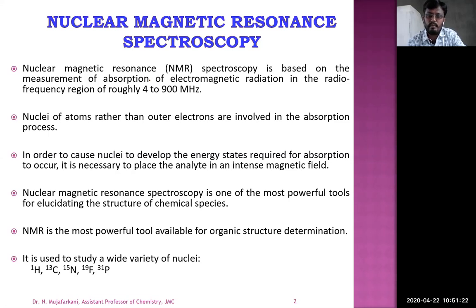What is called nuclear magnetic resonance? Nuclear magnetic resonance spectroscopy involves the interaction between an oscillating magnetic field of electromagnetic radiation and the magnetic energy of the hydrogen nucleus or some other type of nuclei when these are placed in an external static magnetic field. The sample absorbs electromagnetic radiation in the radio wave region at different frequencies, since absorption depends upon the type of protons or certain nuclei contained in the sample.